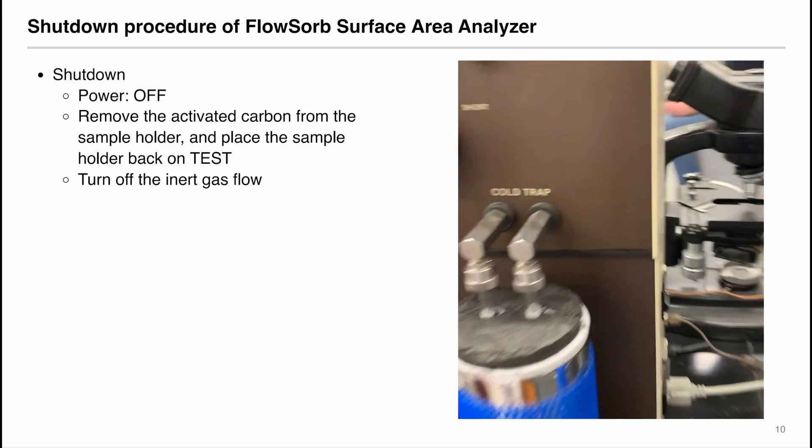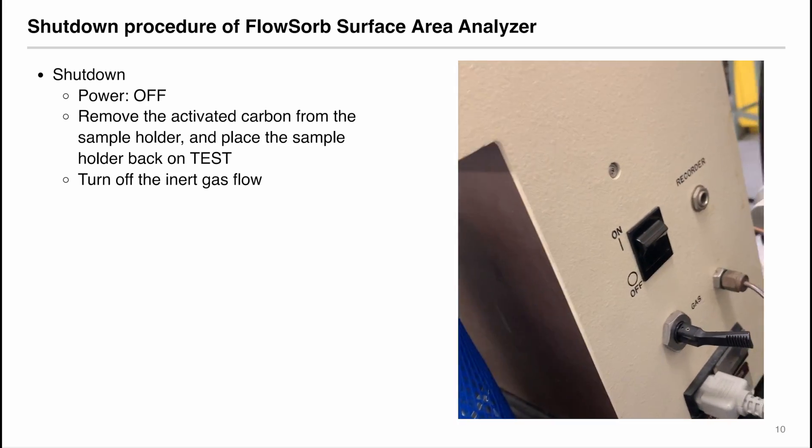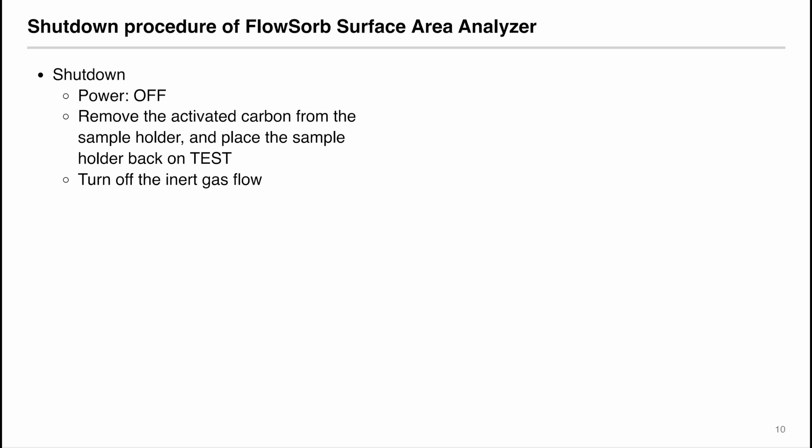To shut down the instrument, first turn the power off. Then remove the activated carbon from the sample holder and then place the sample holder back on test position. As the last step, turn off the inert gas flow.